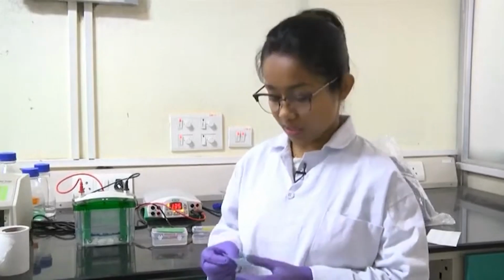Another thing is that for the nitrocellulose membrane, the background noise is very low, but in the case of the PVDF membrane, if you are not careful enough and you skip the washes or do not properly do the washing steps, then there will be huge noise. So with the PVDF membrane, you need to do the washing steps thoroughly to reduce the background noise while detecting your protein.